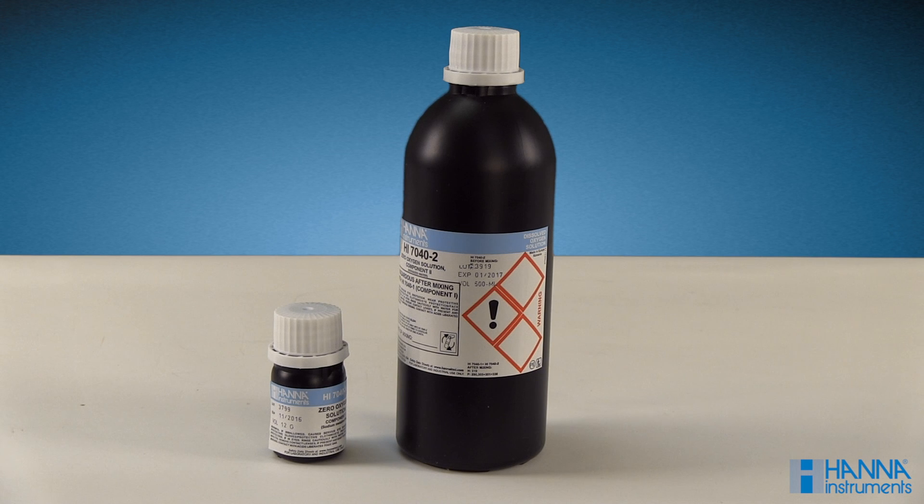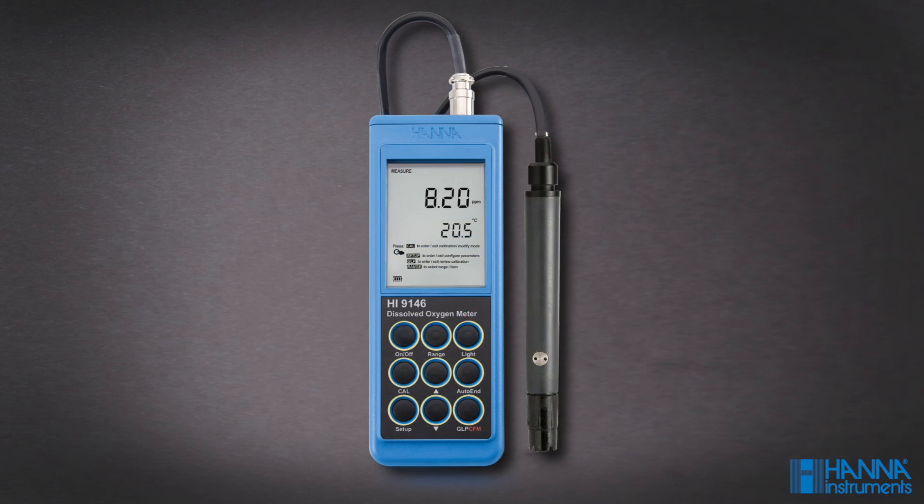A 0% calibration is an optional calibration using HI7040 zero oxygen solution. You would perform this type of calibration if you plan to measure in a lower DO range. Today, we'll be using our HI9146 Portable Dissolved Oxygen Meter to show you how to perform this calibration.